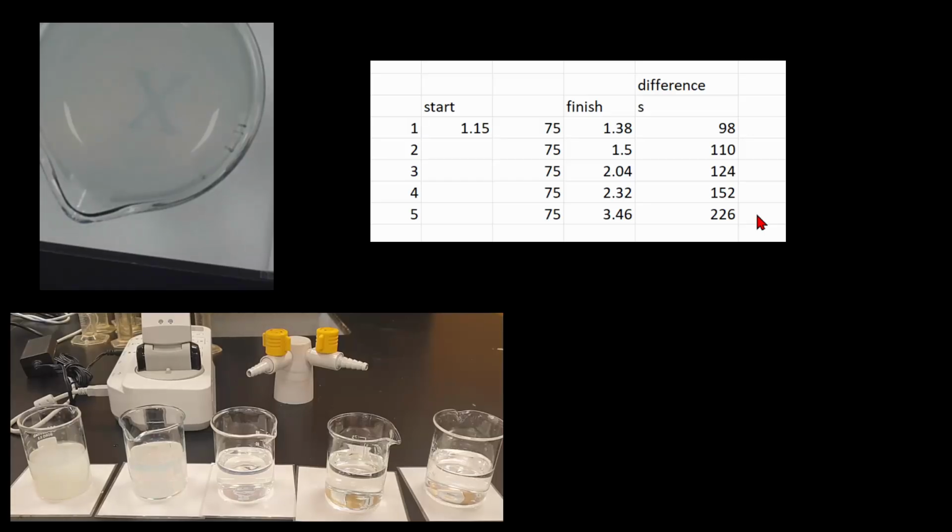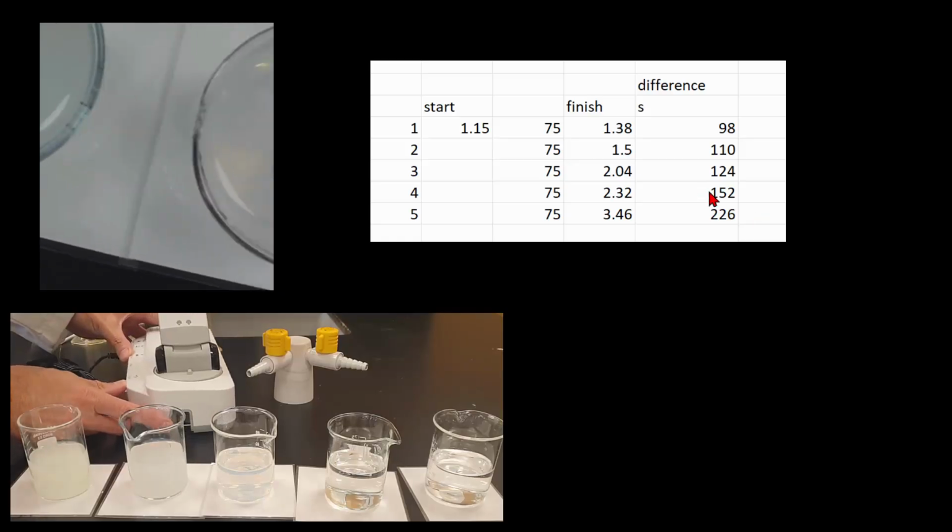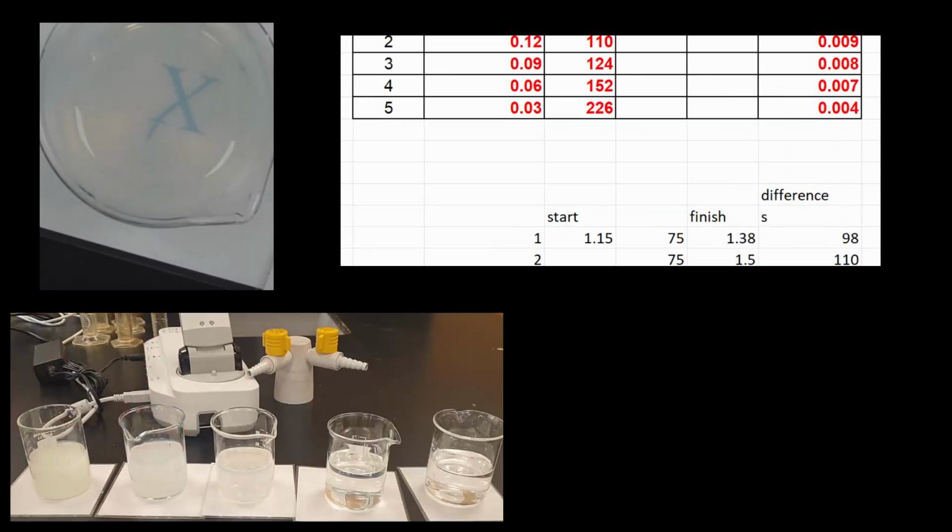And so you can see it just gets cloudier and cloudier, and then all of a sudden you can't see the X. And as soon as you can't see the X, that's stop. All right, that's called the clock reaction. It stops at a certain point.